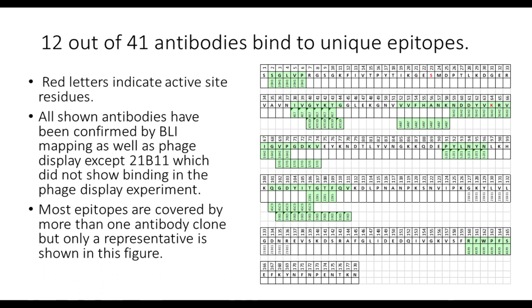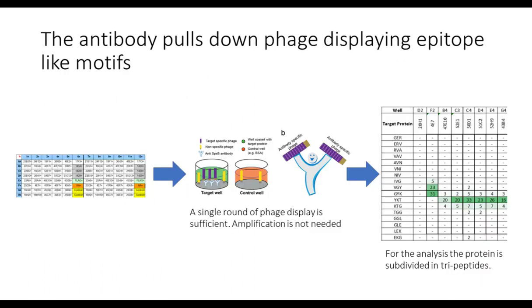And remember, this experiment was done in 2 days because we didn't have to amplify the phage, but we just put it on top, washed it, eluted it, and used it straight for qPCR next-gen sequencing.